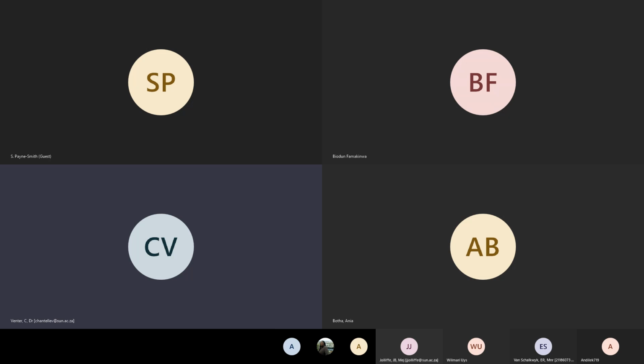Although it's a very, very long and boring process for most people, it is for me the most important part of your sample prep work. And like I said, if not done correctly, it can cause a lot of problems at the end of the day. But of course, that is also why your study has to include controls. So if there is some damage that you caused, you will then know it by looking at your control.